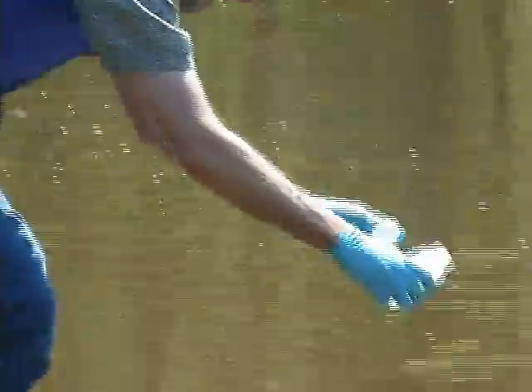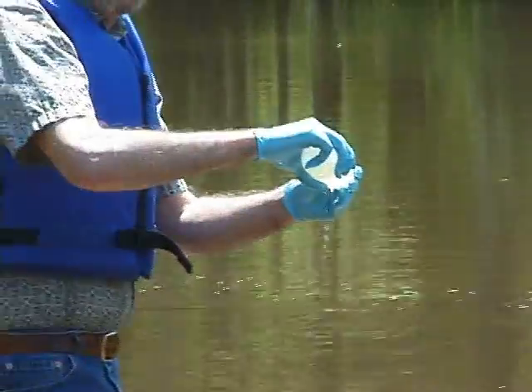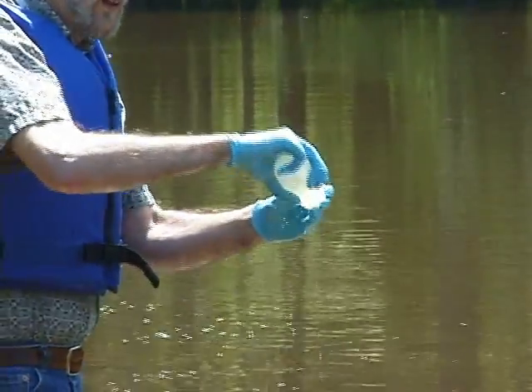Dip upside down, invert, holding the bottle upstream of you, and then take it out.